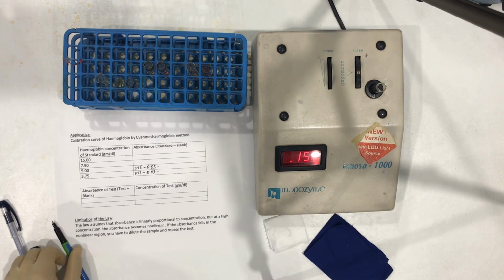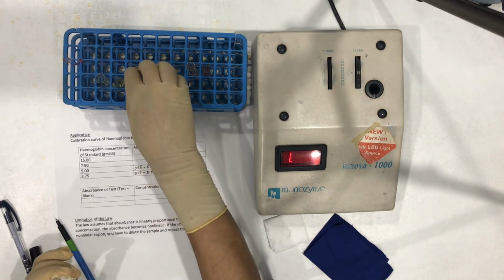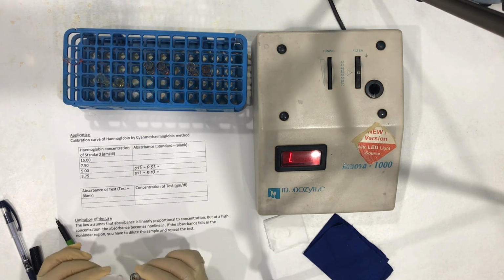Let us take the absorbance of our third standard.